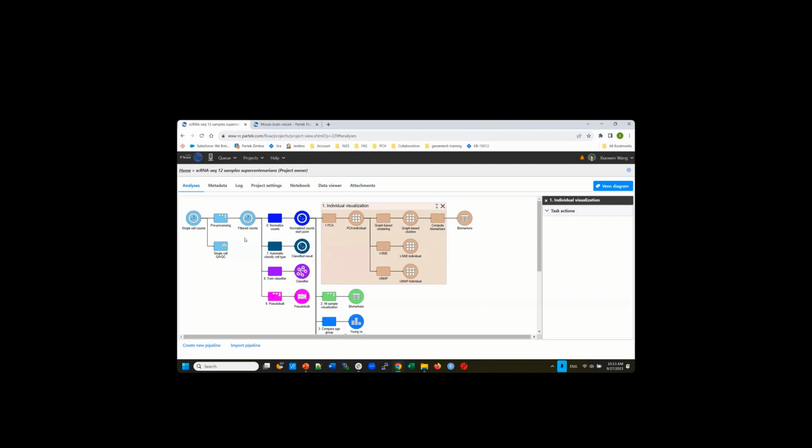So within Partek, in terms of batch removal, we do have several options. One is on the normalized data. So this data node contains the matrix, every cell with every gene as a normalized count. On this data node, if you go to batch removal, we have two options. One is a general linear model, which is based on ANOVA. This is the Partek way to remove the batch. So it's almost like a batch ANOVA in reverse. The algorithm is using ANOVA. And the other one is Seurat3 integration.